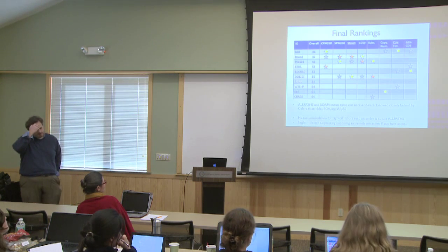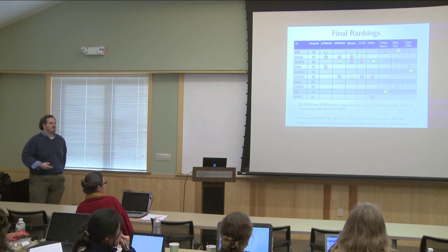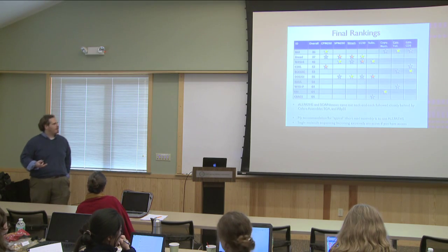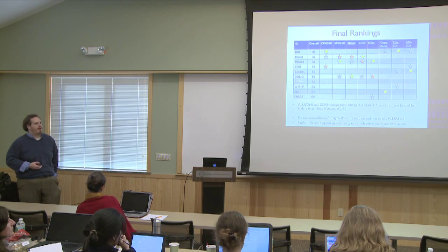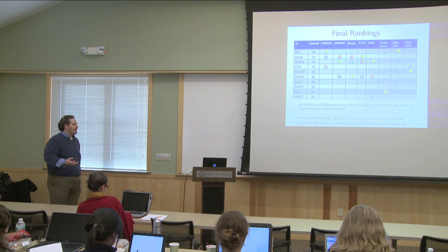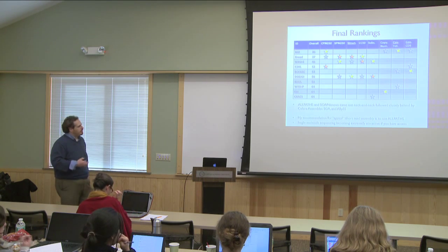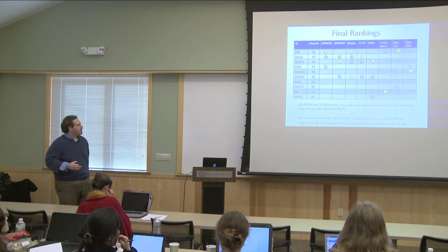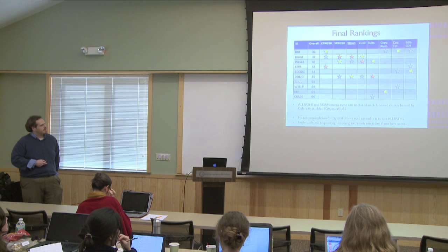As a result of this analysis, Assemblathon 2, lots of internal testing I do here, and lots of other projects I've worked on, my really strong recommendation, if you're going into a new genome and want to know what you should use today, is to use ALLPATHS. It works really well. You're going to get a very good assembly without a lot of hand tuning.